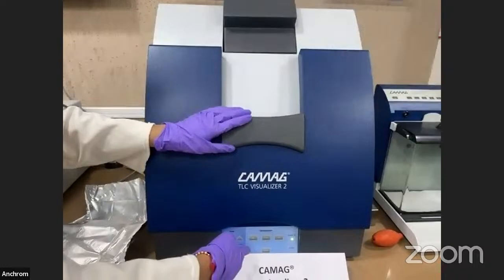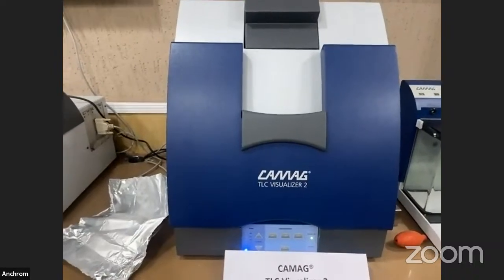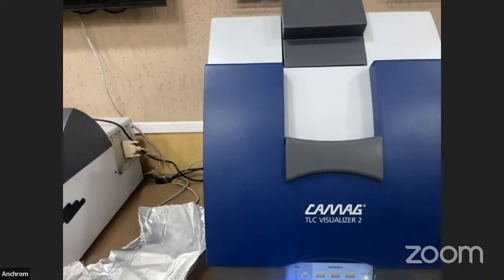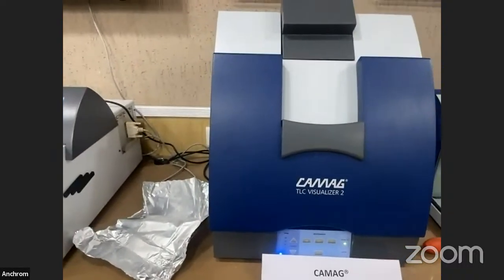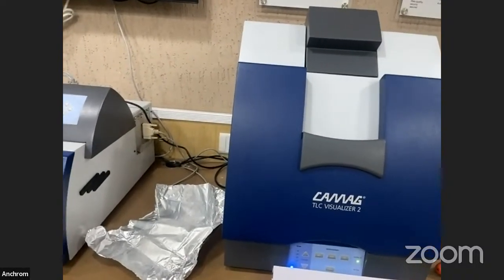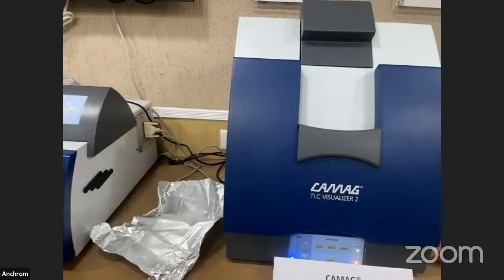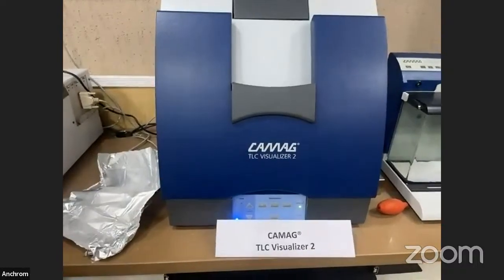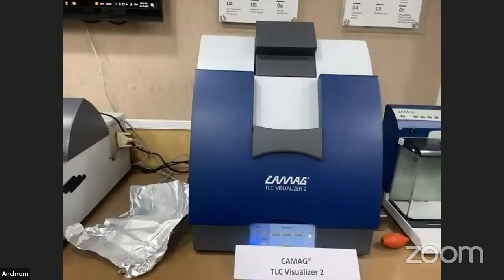So after capturing the plate image, we'll see the plate image in visionCATS software.